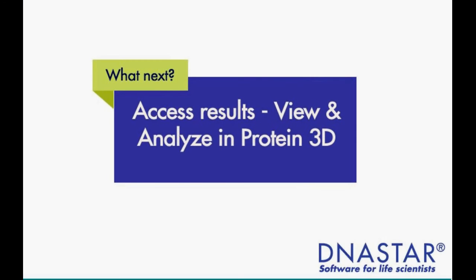So we've introduced the many ways in which you can access NovaFold, given you a background on the development of NovaFold itself, and really the advantage that it has over homology modeling, in that you don't need a template with high sequence identity to your protein of interest. So the next question after running the prediction is simply, now what?